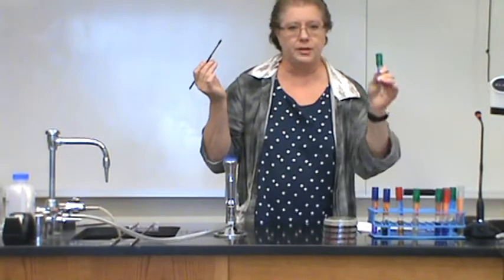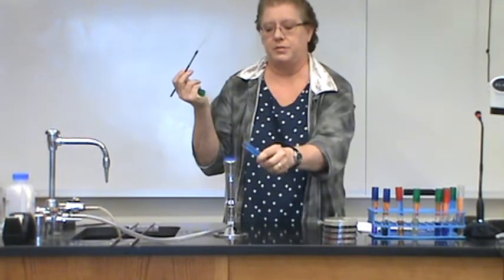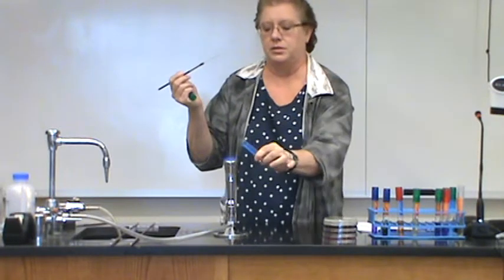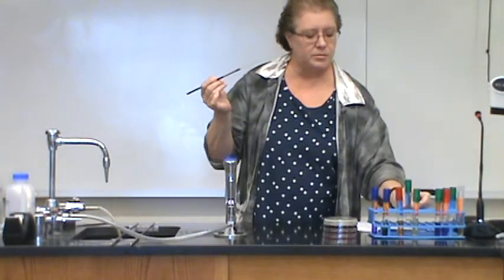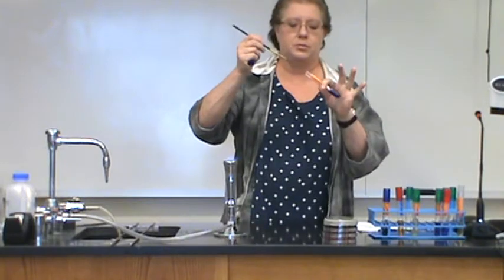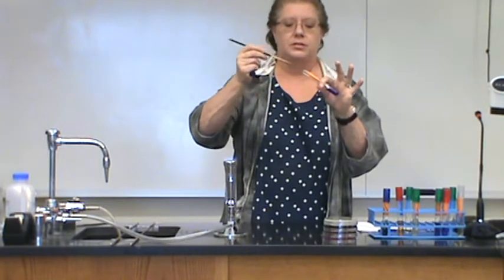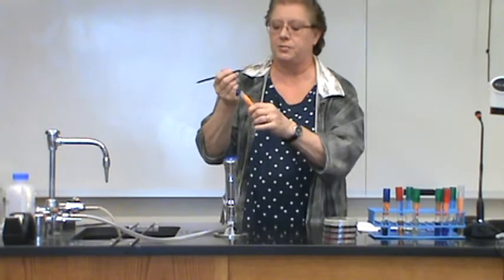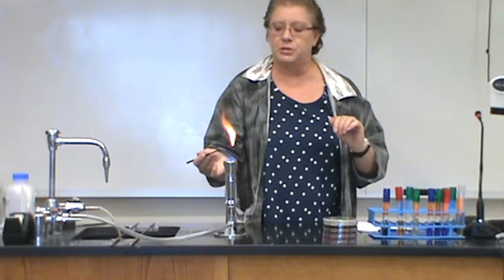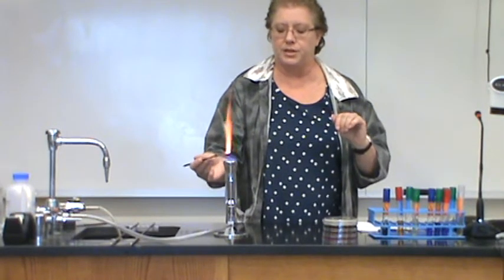So pick up your unknown again. Flame the top. Remember, this is hot. Cool it. Get another loop full of bacteria. Flame the top. Put it down. Then pick up your lactose broth. Flame the top. Take your loop full of bacteria. Jiggle it around in the broth. Flame the top. This is your lactose broth that is inoculated now. And then remember to flame this before you set it down, since it has bacteria on it. So now you have successfully inoculated your 3 different carbohydrates, glucose, mannitol, and lactose.